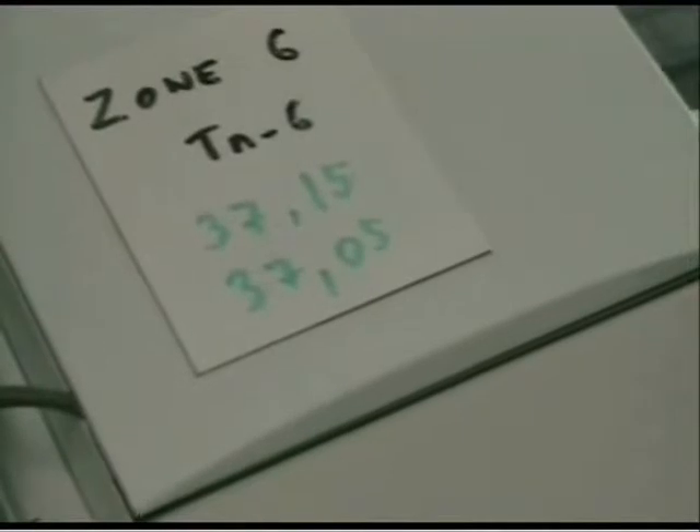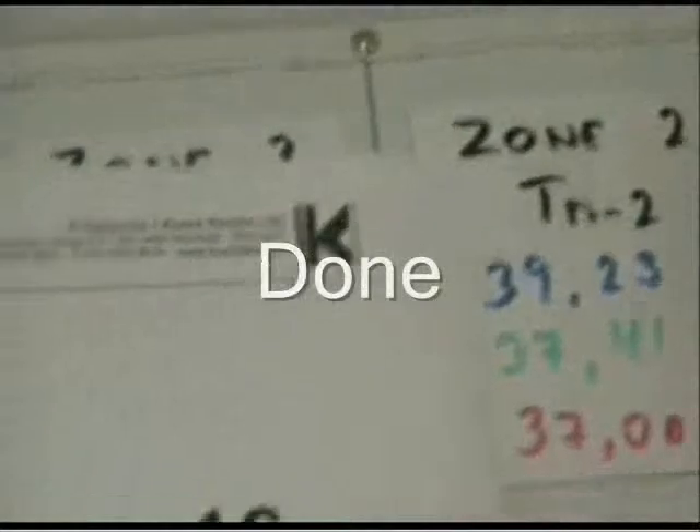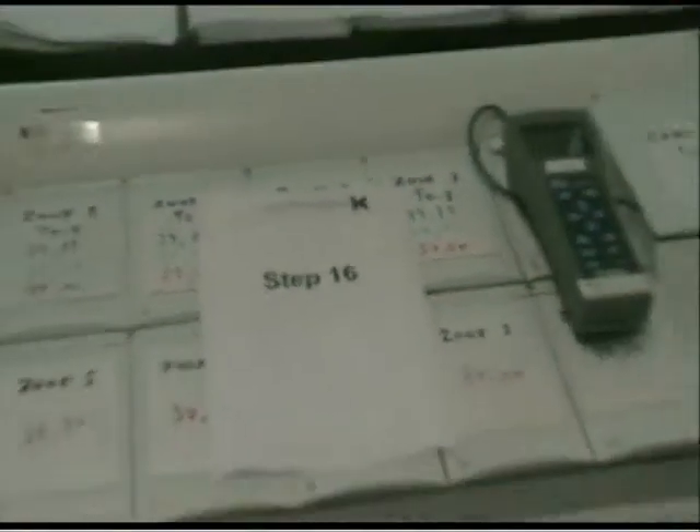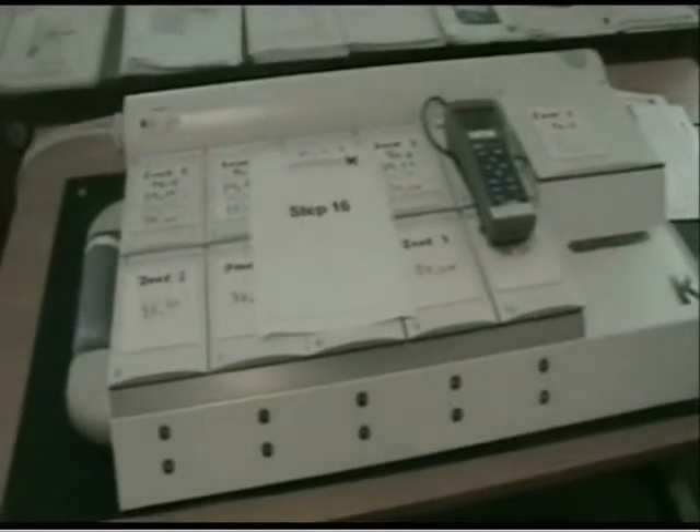Step 16 — we are done. I hope that you have enjoyed calibrating the temperature on the G185 with us. If you have any questions, feel free to contact our distributors or K-Systems directly. Thank you.